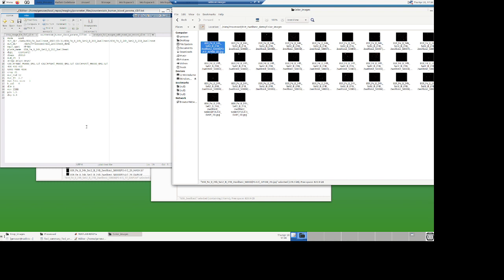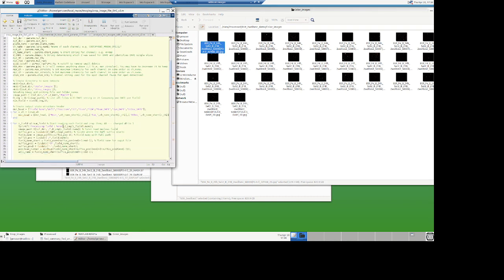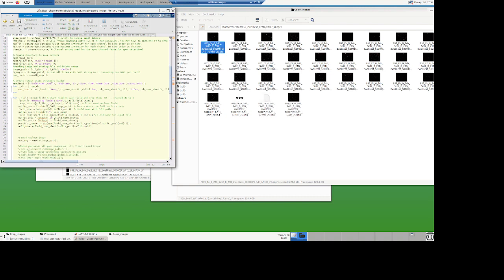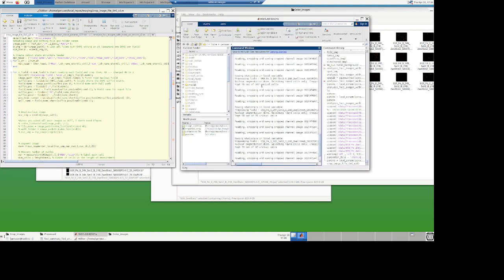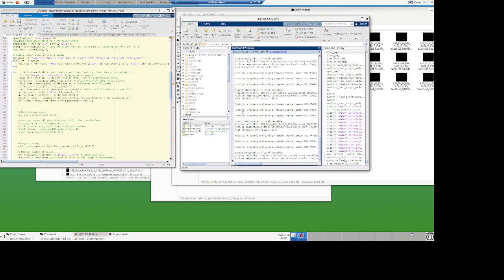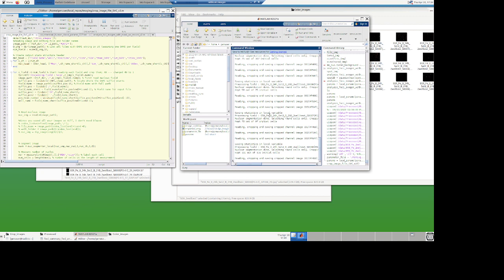And then what the system does, if we go back here, if you look at the code, it's very simple. I read the image by field of view for each field. And there's an output in MATLAB that tells you where we are. It's reading, cropping, statistics, and so on. So you have an output that tells you how many nuclei it kept. So it does a segmentation. Then the 58 out of 75, that's based on the P2A filter and also the intensity cutoff that we have.